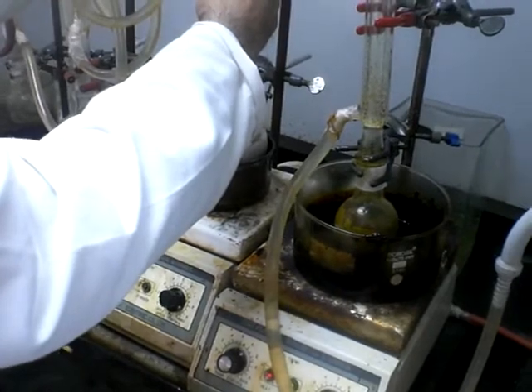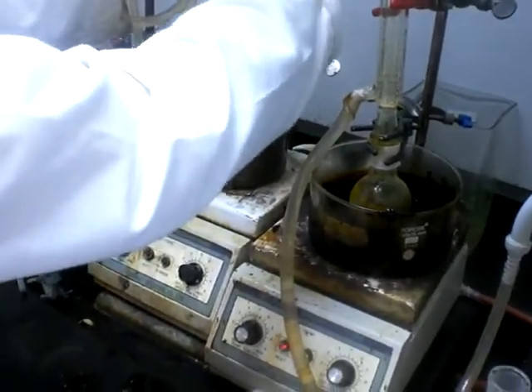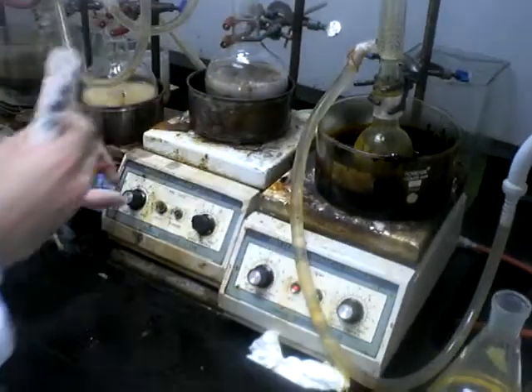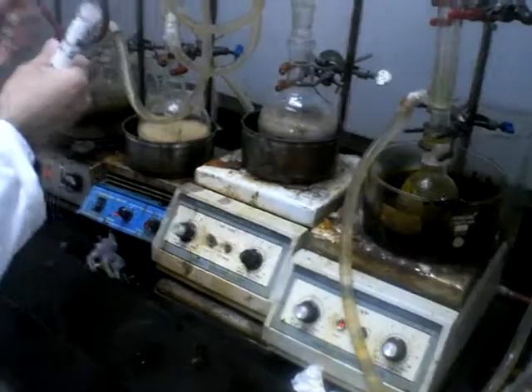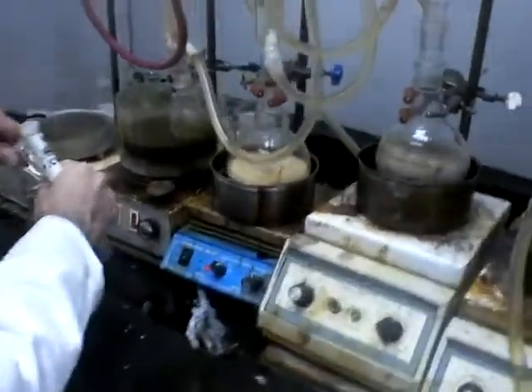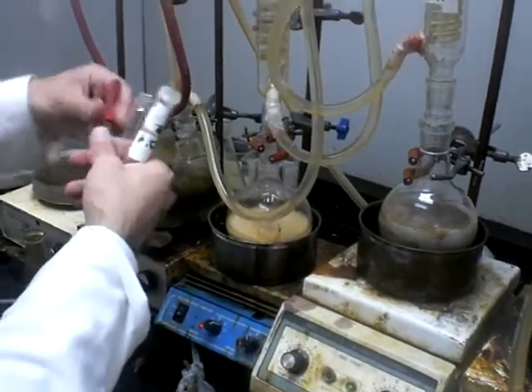Take a sample from the solution in order to see if the product has occurred, or if we still need to give it more time, or even to change the procedure of the reaction completely.